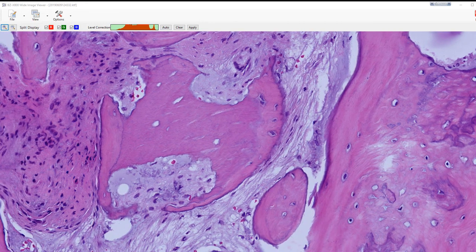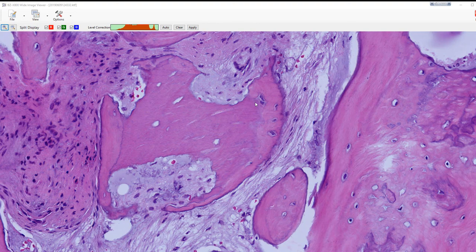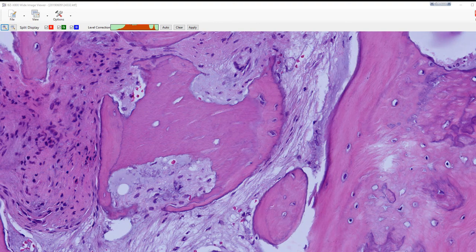For example, look at the detail here, where you can see the resorption of the grafted material really, really well.